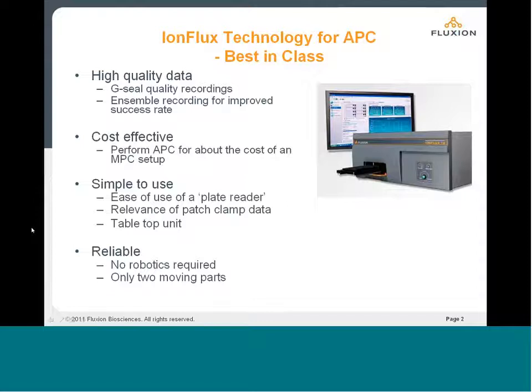And again, because the system is much more compact and simple, and because we are using microfluidic devices, the liquids for the experiment are preloaded before the plate goes into the reader itself, which makes for a much more compact and streamlined reader, and therefore there are no robotics required. Although since it does operate like a plate reader, it is fully integratable with standard liquid handling robotics. And essentially within the instrument, there are only two moving parts.